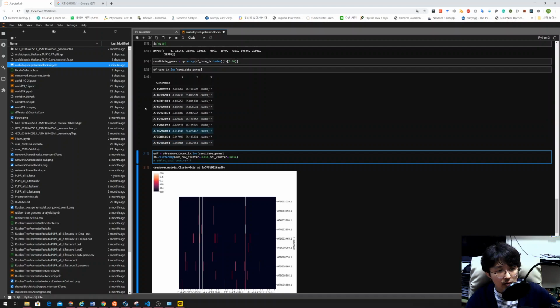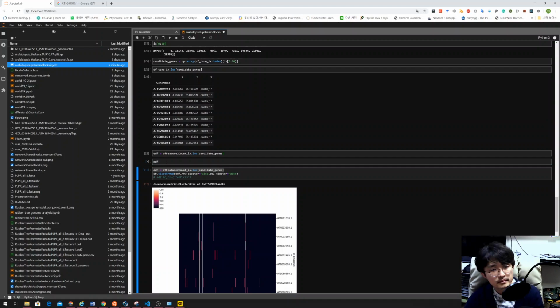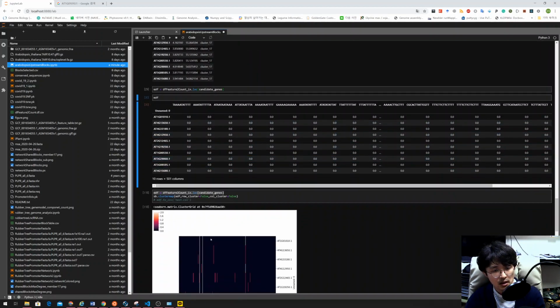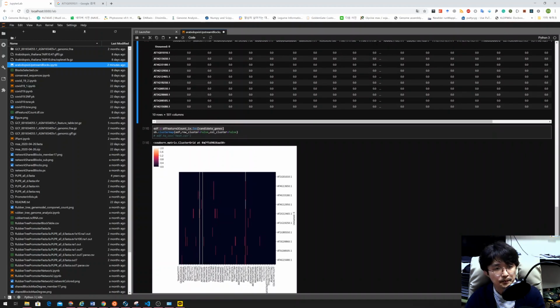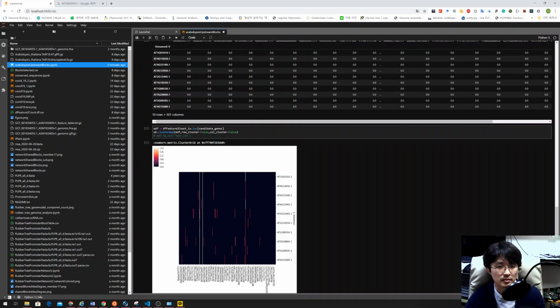So we can limit the feature to count. Right? And yeah, so this is the profile. So everything here is a profile for each gene, and we can see, okay, these genes have a similar profile. Interesting, right? So let's run it, and we will see the same picture.